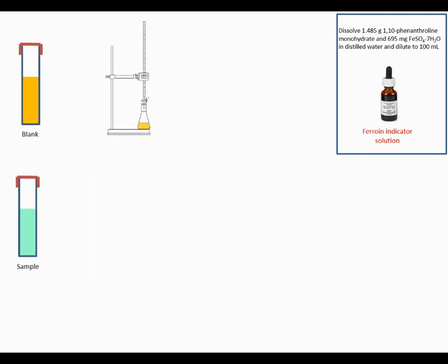For titration, all the liquid in the tube is taken into a beaker. Every drop of the liquid in the tube should be taken. For this, the tube is washed with pure water and the water is added into the beaker again. There is nothing wrong with the added pure water.